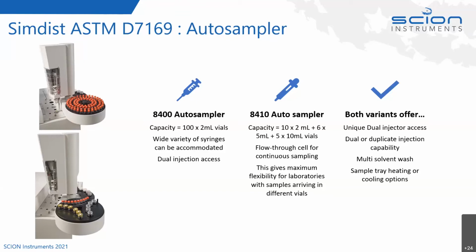into the cooler laboratory air. So your needle and your syringe will be nice and cool for the next injection into the volatile carbon disulfide samples. So that is so there's no modification to these autosamplers. It's the same autosamplers that would go out for any sort of liquid injection. It's just that with it, it's very useful to have that tower to move away from the hot injection port after analysis. We don't have to have any extra cooling.